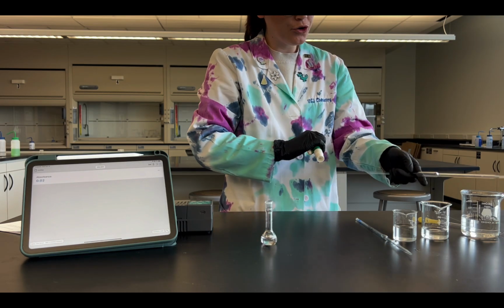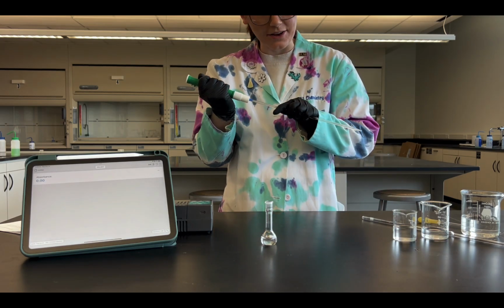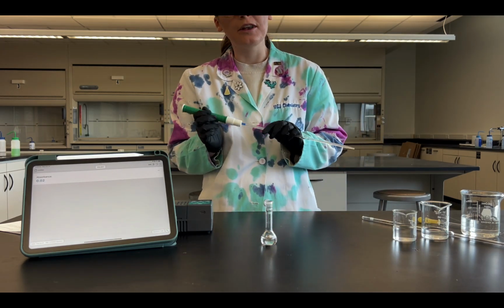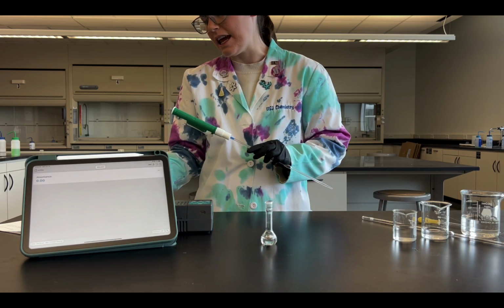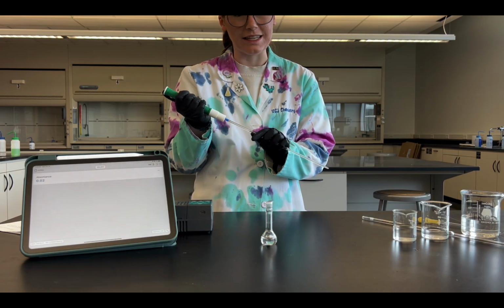And then I'm going to use 1 milliliter of the sodium thiocyanate. So I'm doing test tube number 6 that is listed in your lab flow handout. So I'm doing test tube number 6 as our example for part 2.